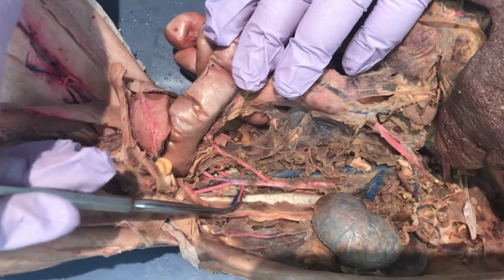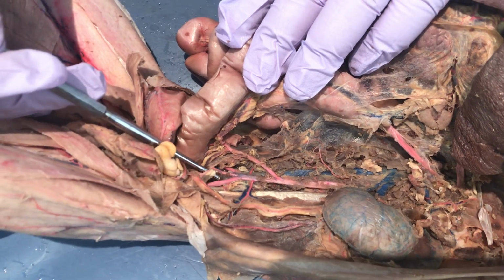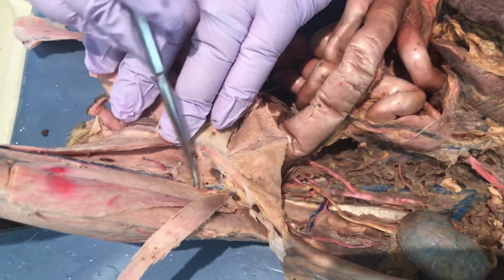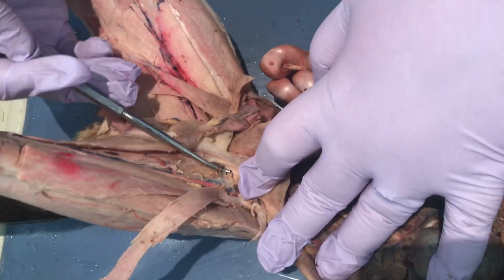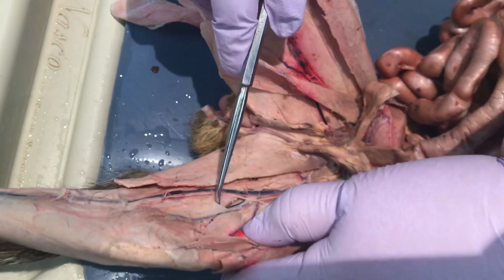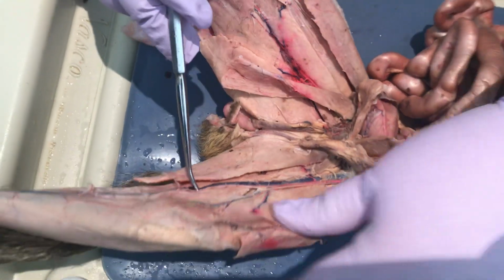We have the iliolumbar artery and vein. Then we have external iliac artery and internal iliac artery. The external iliac artery will enter into the legs, and it becomes the femoral artery. We have the deep femoral artery over here, sorry. And then the femoral artery will come down into the leg, there we go. And it branches into one going behind the knee, the popliteal, and the other one stays superficial, the saphenous. Okay.